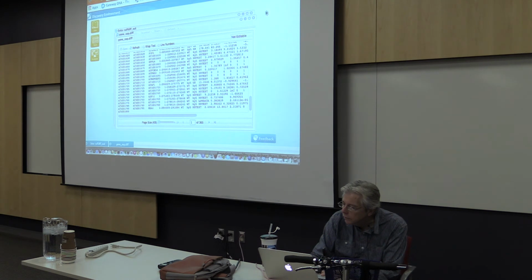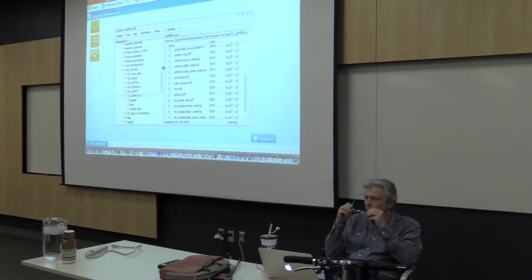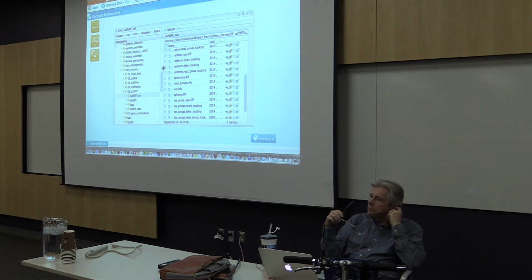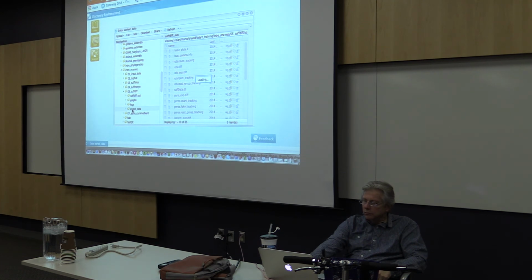You have the same thing for your isoforms. So in that analysis that has all the isoforms, are they averaged out or included, or does it just spit out isoforms on the side into a different file format? Well, I think it includes all the isoforms. Your annotated isoforms should all be in there. Okay. It's probably mostly going to be annotated ones with this kind of workflow. And you also have a section where the data comes out pre-sorted for you, and that's pretty handy.